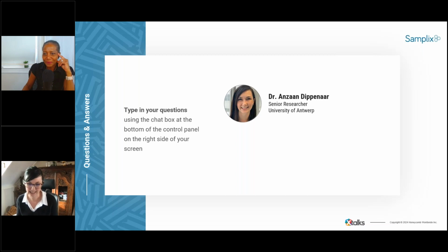So what people have done is heat, enzymatic, mechanical. And from the preliminary analyses that we do in our group, it seems like mechanical lysis using some kind of bead, to say it very crudely, to bash open the top cell wall of MTB seems to be the most effective. Because with too much heat or with a very long exposure, you also risk damaging the DNA that you get out, and that in turn affects the sequencing negatively. So we think that mechanical lysis is the best approach at this stage.